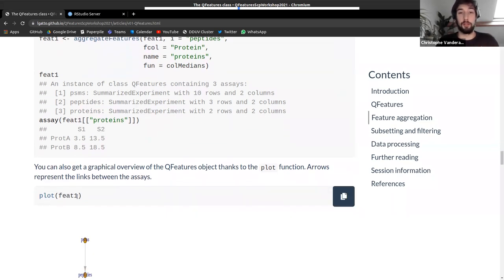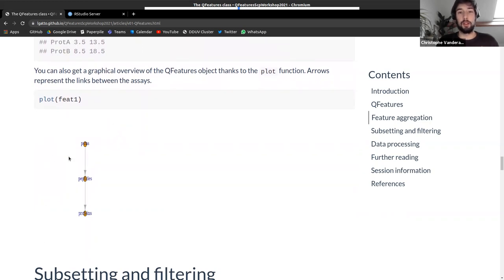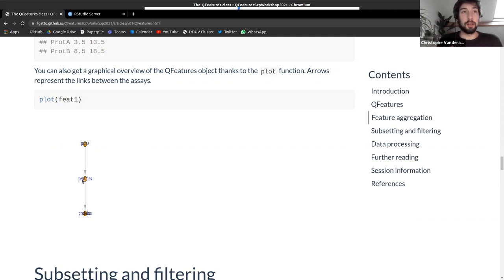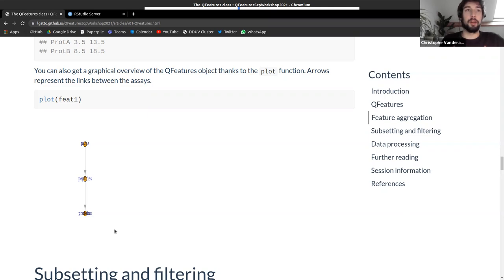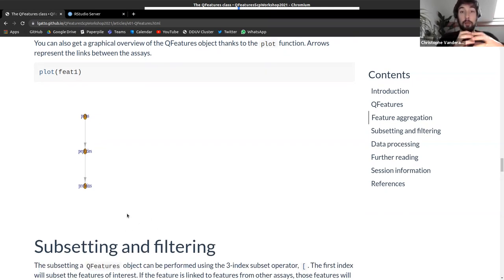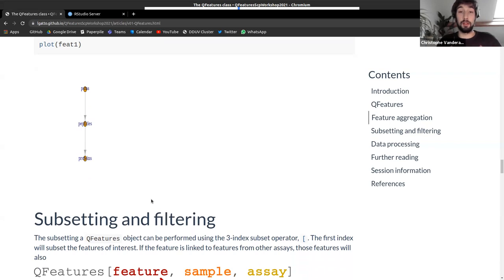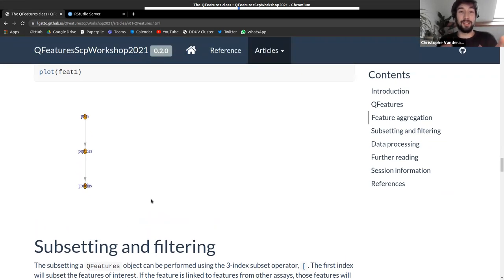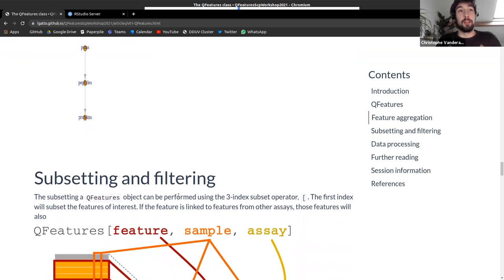There's a plot function for QFeatures objects that gives an overview. In this case it shows: a PSM assay aggregated (arrow) to a peptides assay, which is then aggregated to a proteins assay. For larger datasets or longer workflows, this plot helps you quickly see what was done and also serves as a workflow summary for reporting.